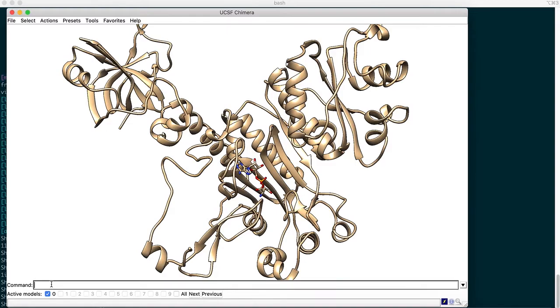So we'll just type, let's say we want to highlight the first residue, which is residue number 171 that belongs to this binding pocket. So we'll just type select #0. Now you might ask me why #0. So #0 stands for the model number. If you're loading one model, that is one structure from a file, that is represented as the first model, and the numbering given to that is 0.